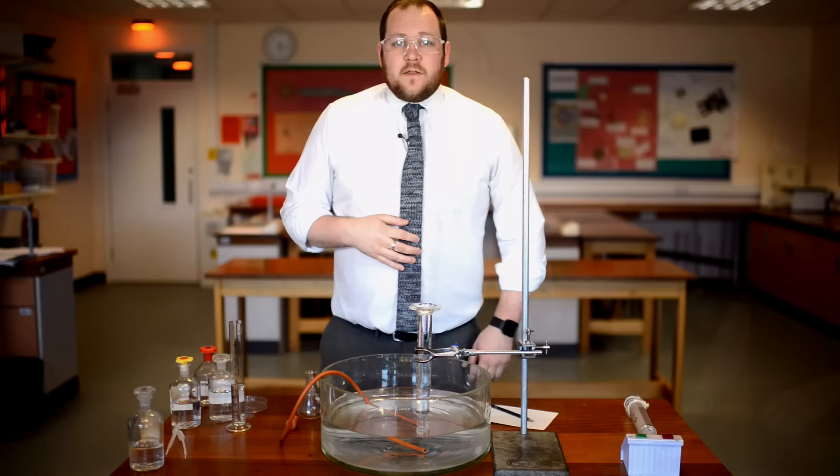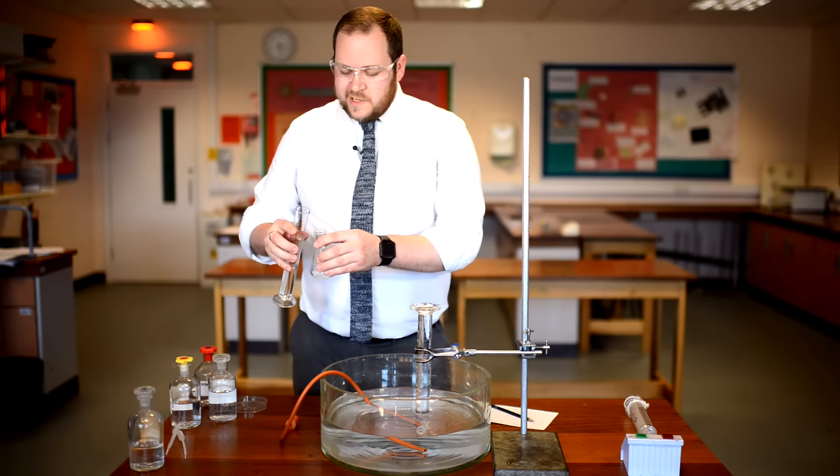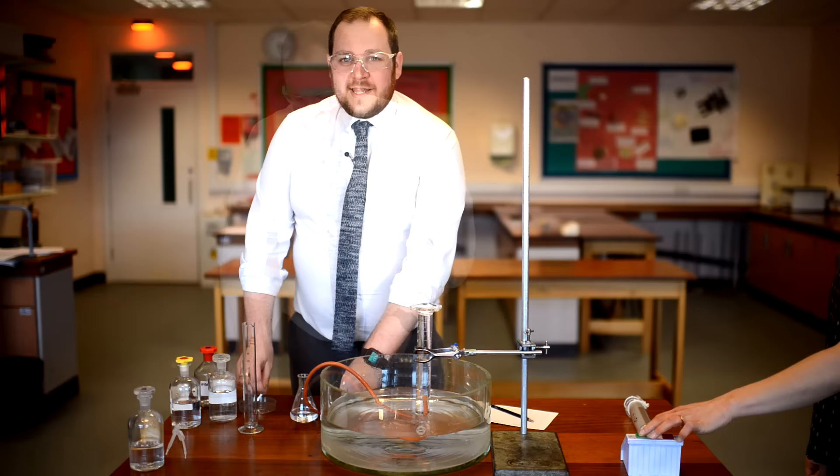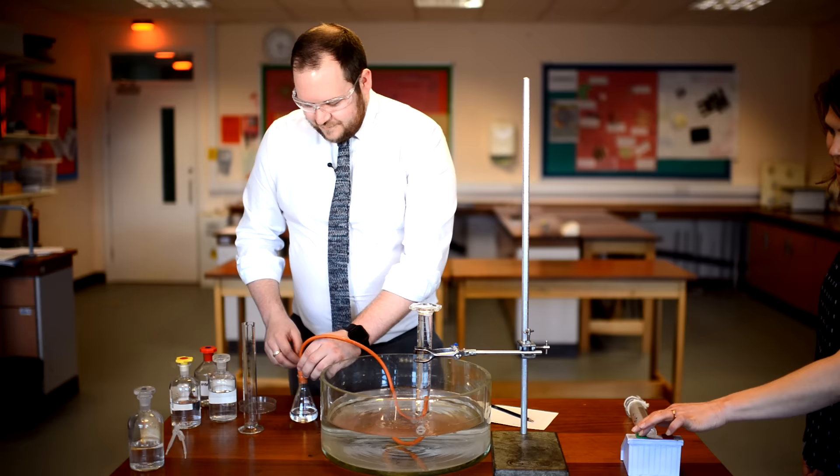This time I'm using the one molar hydrochloric acid to see if the reaction is a little bit slower. I'm going to once again pour the hydrochloric acid into the conical flask. As you add the magnesium, insert the bung and start the timer at the same time. Once again we're measuring the gas produced every 10 seconds.